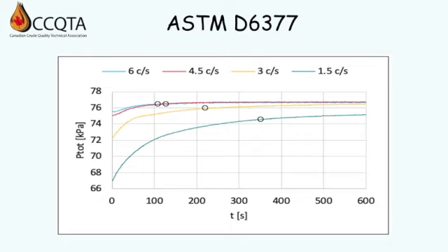In the interim, users are advised to consult with their instrument manufacturer regarding using the highest agitation rates practical without impacting the operation or sensitivity of the instrument. Understanding that the highest vapor pressure should occur at thermodynamic equilibrium, when comparing results, the highest results should be considered correct unless proven otherwise. If the measurement results are in doubt, confirm that the instrument is functioning properly and then repeat the measurement at different agitation rate.